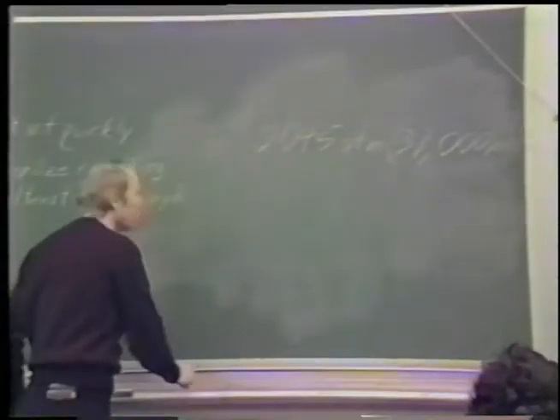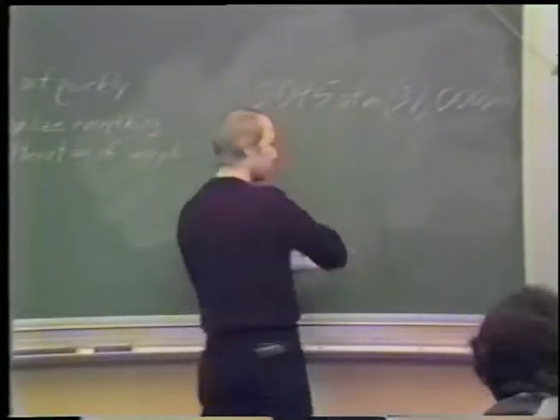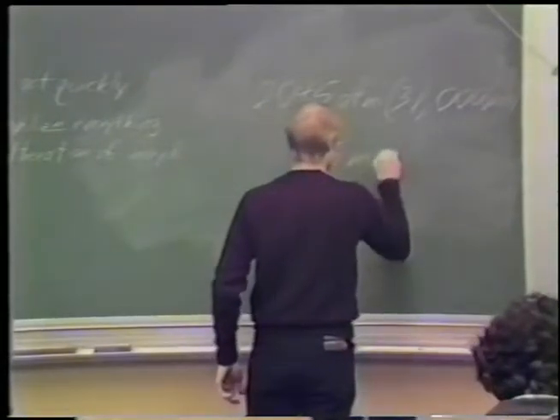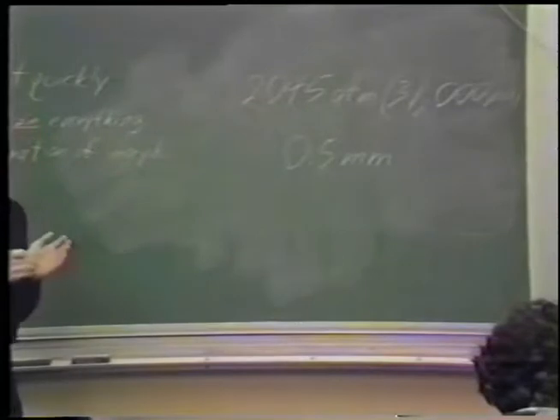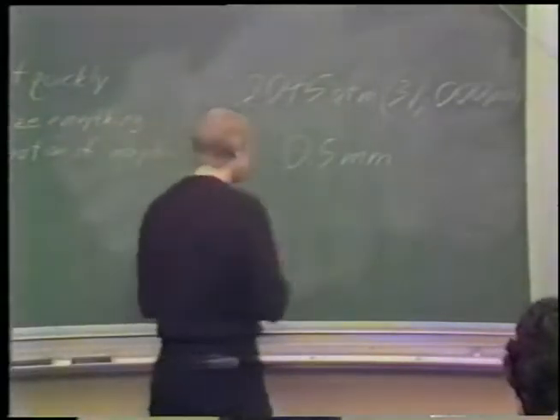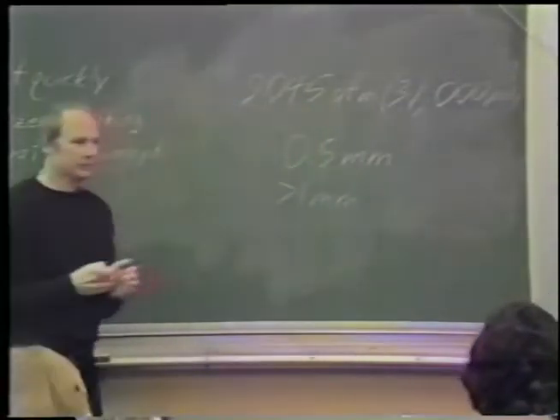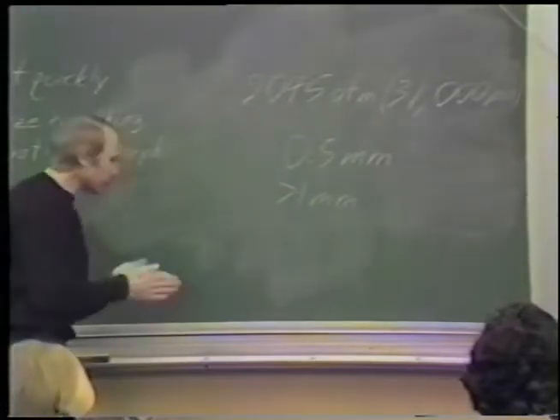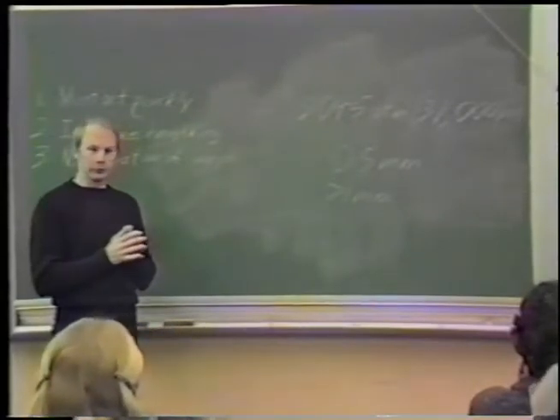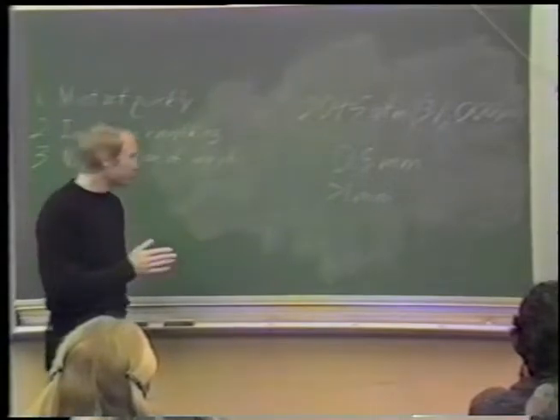In this case, one can suppress ice crystal nucleation and growth in samples, if they're a flat slab, up to half a millimeter thick, an order of magnitude larger than you can do at atmospheric pressure. If it's spherical, you can do greater than a millimeter. And this may finally allow us to get at what's going on inside larger pieces of tissue, which have heretofore not been suitable objects for other modes of ultra-rapid freezing.